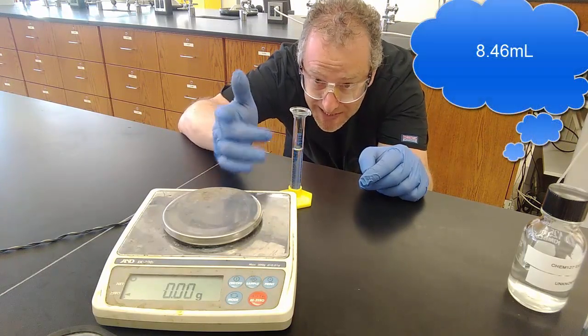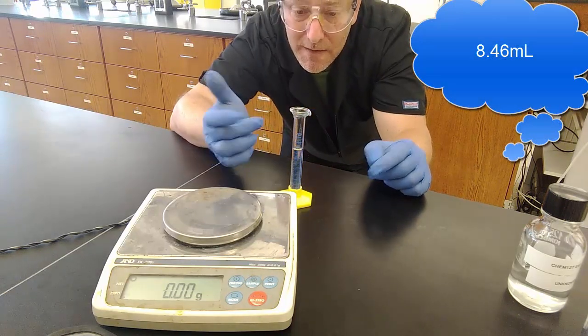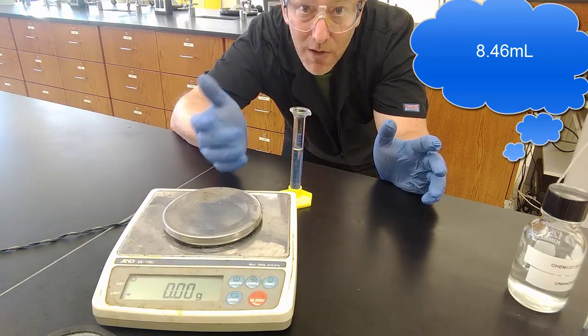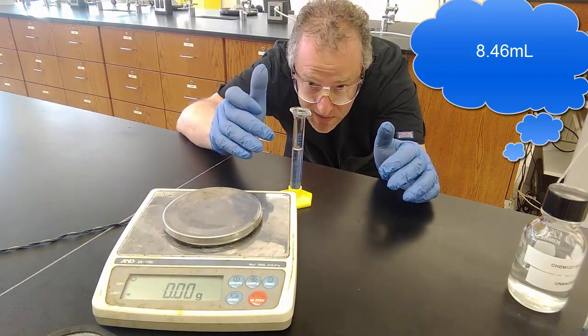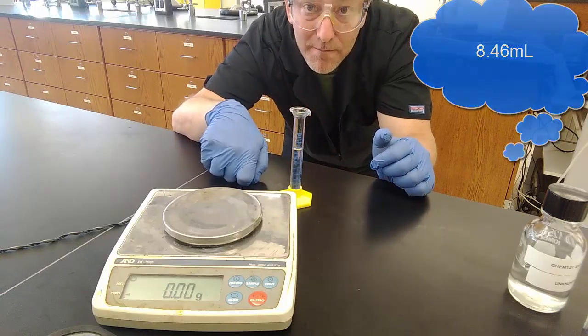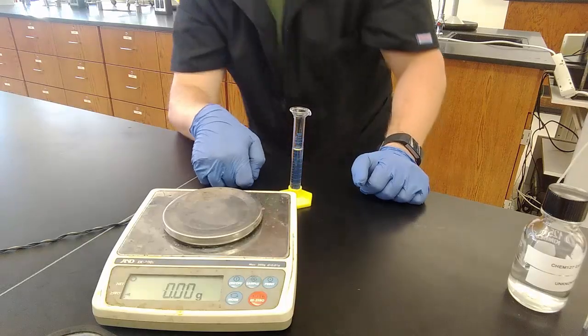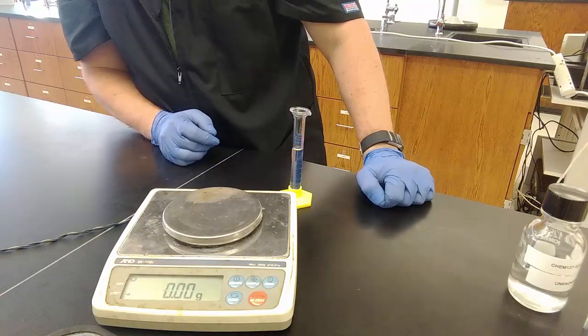8.46. If it was exactly halfway between the 8.4 and the 8.6 line, then it would be 8.50. But it's not. It's a little bit underneath halfway between 8.4 and 8.6. So I'm going to call this 8.46 milliliters. Okay? And so I would fill that in line 2E.